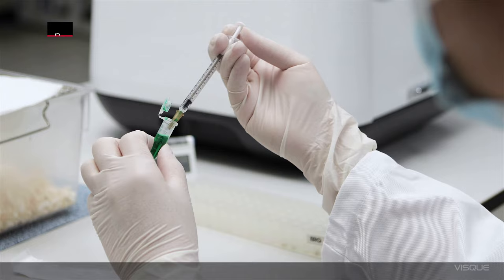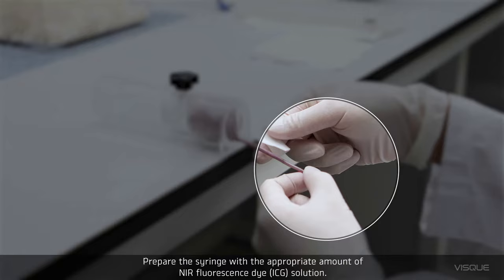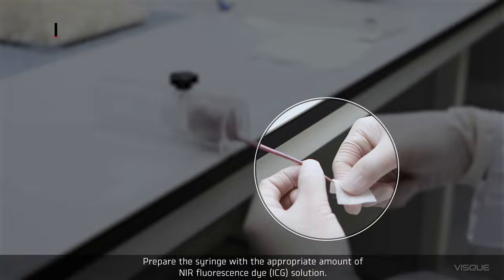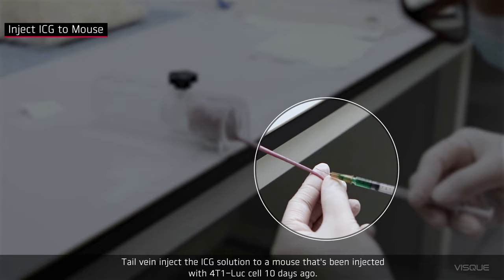Prepare the syringe with the appropriate amount of NIR Fluorescent Dye Solution. Tail vein inject the ICG solution to a mouse that's been injected with 4T1 LUC cell 10 days ago.